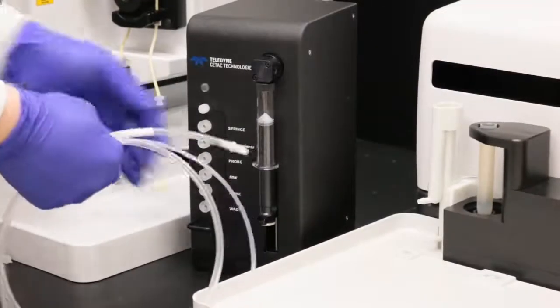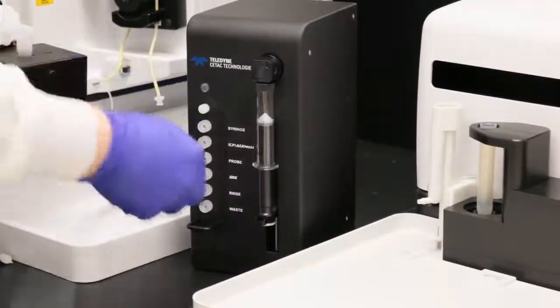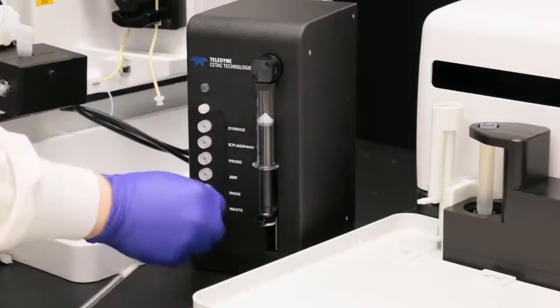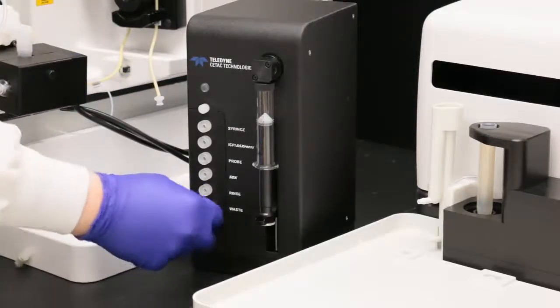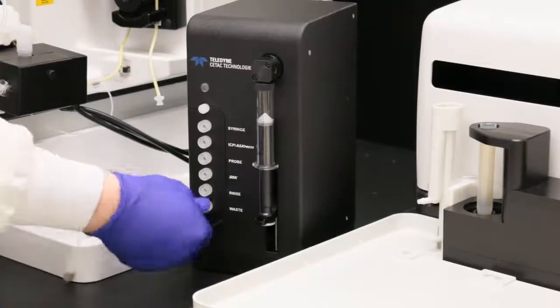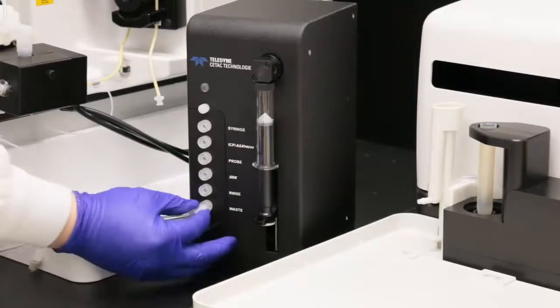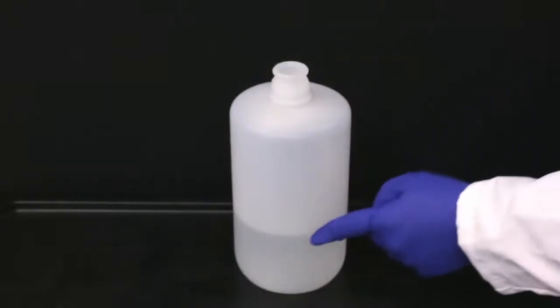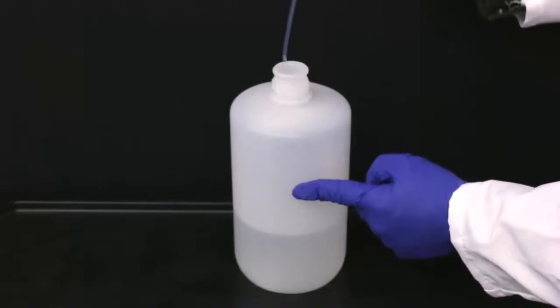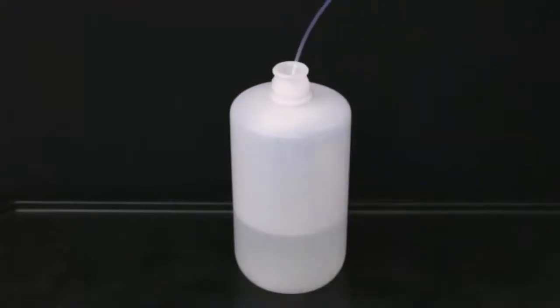Locate the waste tube. Connect the waste tube to the waste connector on the front of the SDX pump module. Tighten the fitting with your fingers. Place the other end of the waste tube into the waste container. Ensure that the outlet of the waste tubing is placed so that it will remain above the surface of the liquid in the waste container.